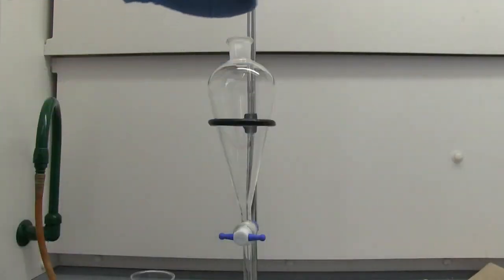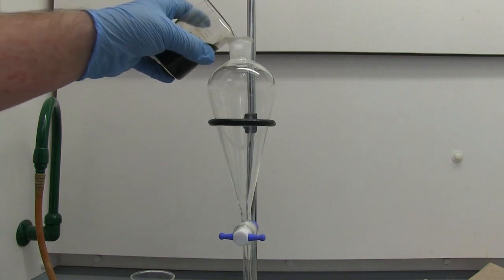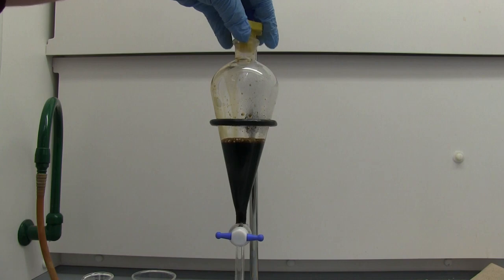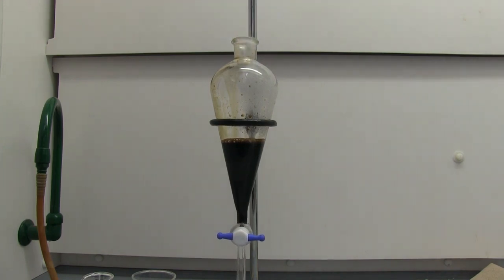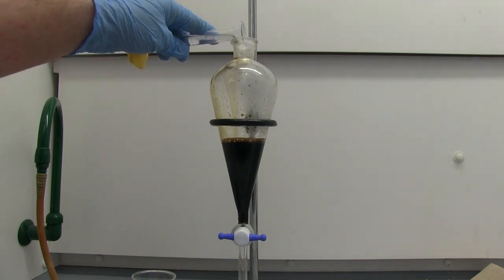We just want to transfer the liquid. There are still boiling stones in there so I'm going to carefully pour it and try not to get the boiling stones. You've all done extraction before with separatory funnel. I'm going to add in ten milliliters of dichloromethane.